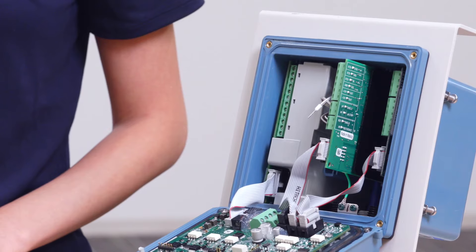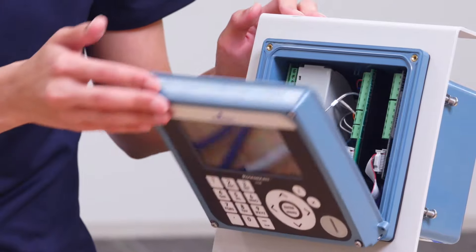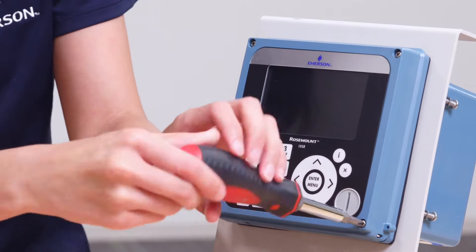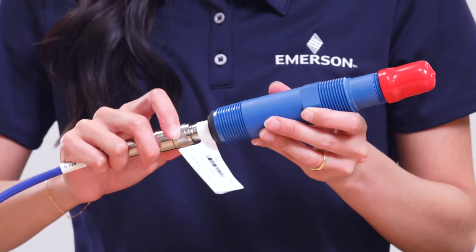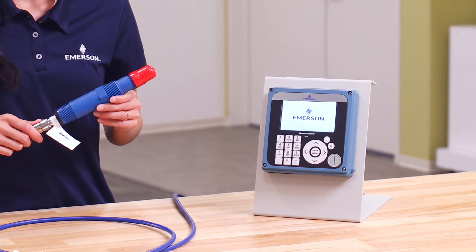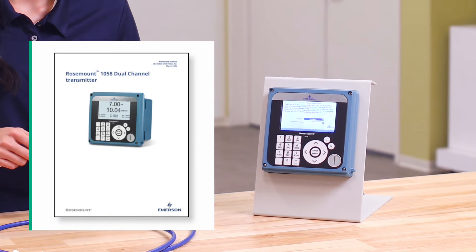Now that all the wires are in place, slide the PH/ORP panel back into its original position and close the cover of the transmitter, then install the four screws. Attach the VP connection, then power up the transmitter, and begin the quick start initial configuration process. More information on the startup procedure can be found in the Rosemount 1058 transmitter manual.